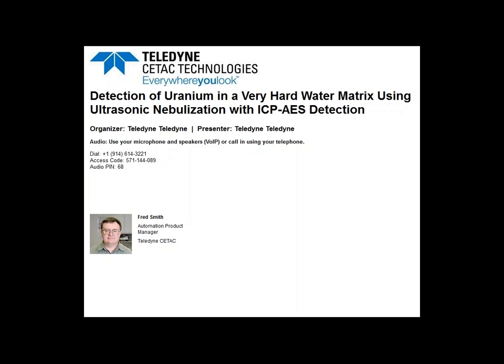So in this presentation, we'll examine the utility of coupling an enhanced nebulizer system, that being an ultrasonic nebulizer, with ICP-AES for improved detection of uranium, and this in a simulated very hard water matrix.